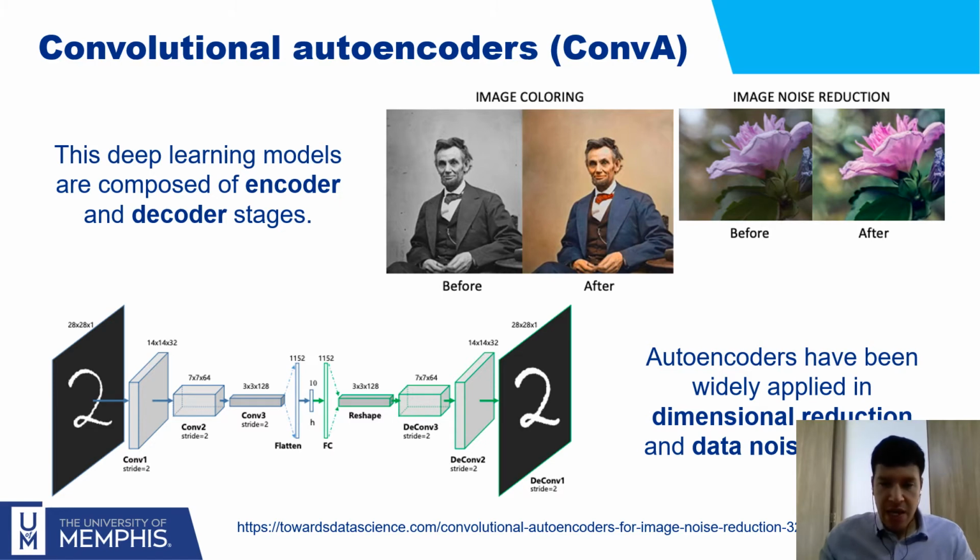That's the main idea, essentially to remove noise. Why? Consider that noise is not the most important part of the information present in an image, for instance, the speckle noise in DHM. Well, this information is somehow removed in the first stage of the autoencoder, that is in the encoding part.